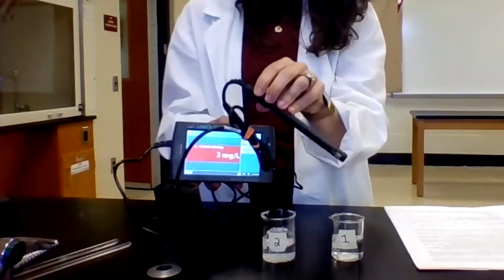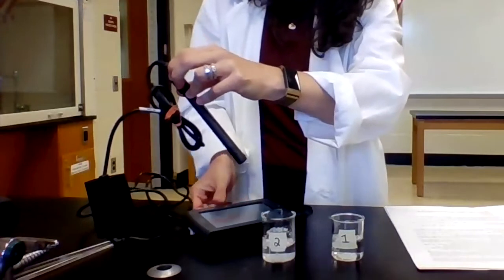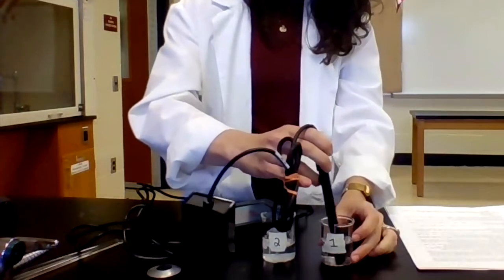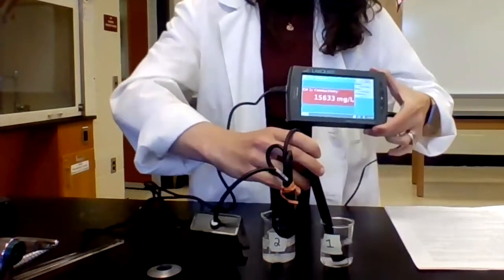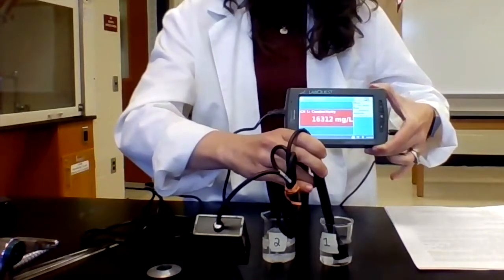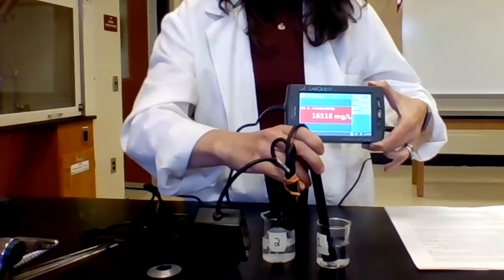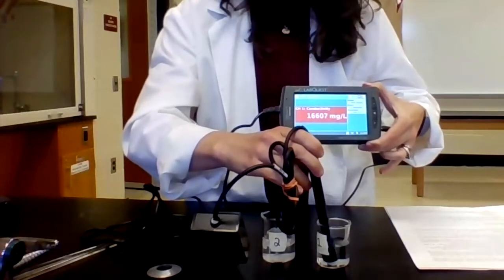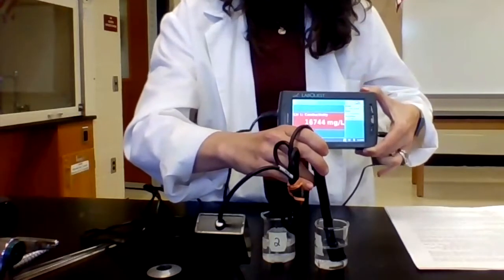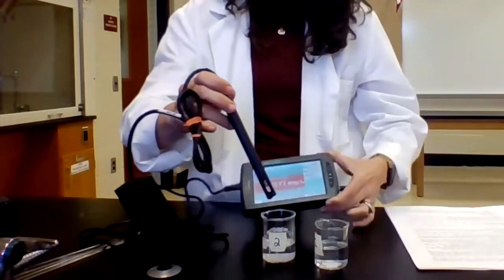So I'm going to put the probe into each of the beakers and see what number comes up. So let's start with number 1. What I see here is the conductivity is very, very high. It's reading above 16,000. That is telling me that solid 1 is most likely ionic. This has incredibly high conductivity. As we know, ionic compounds are strong electrolytes. So most likely solid 1 is an ionic compound and not polar covalent.